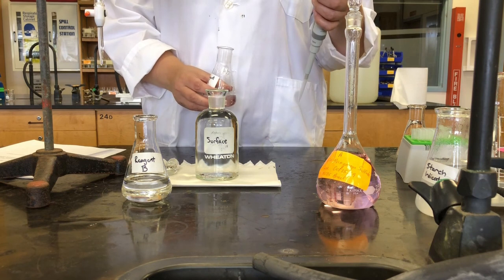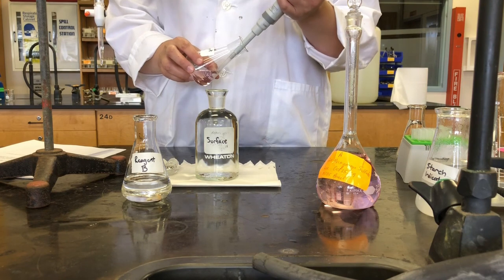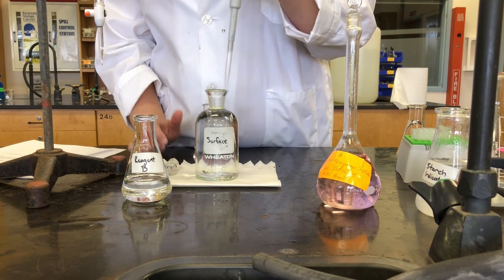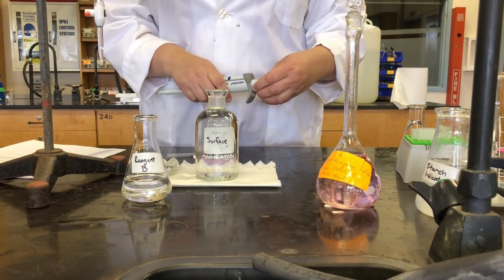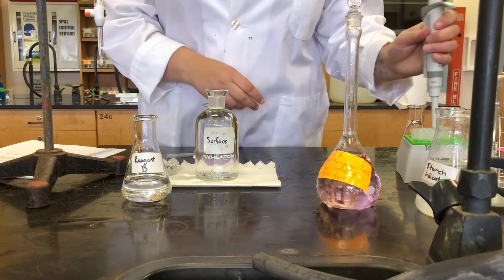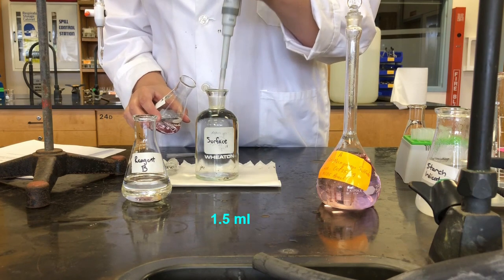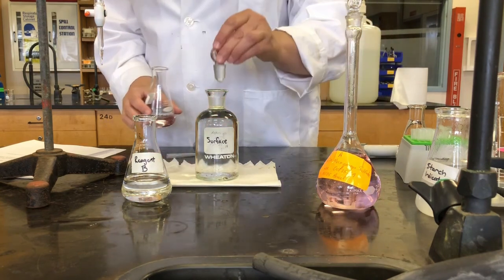Okay. So I have an Eppendorf pipette, and I have that set on 1000 right now, so that's 1 mL. I'm going to add 1 mL first. Adding it below the surface of the water. Okay. Now I'm going to change my Eppendorf volume to 500. And I'm going to add another 500 microliters, so that's for a total of 1.5. Okay, so below the surface of the water. Okay, so that's our manganese sulfate.